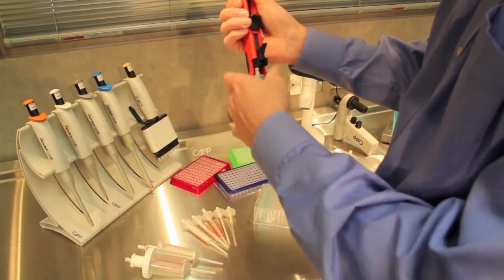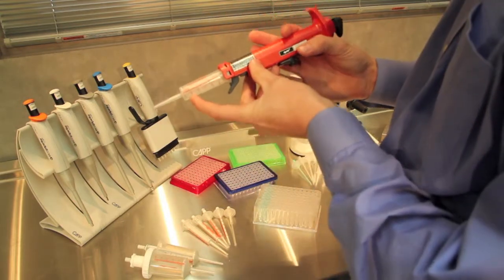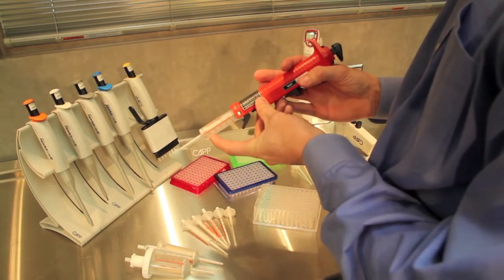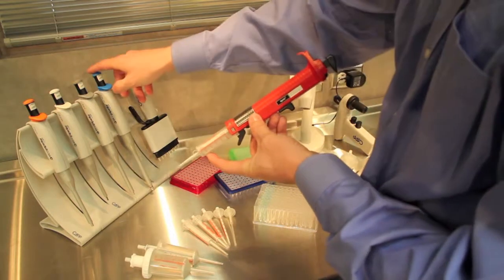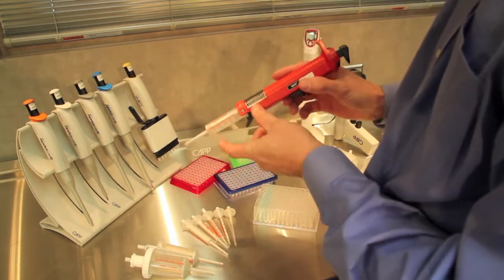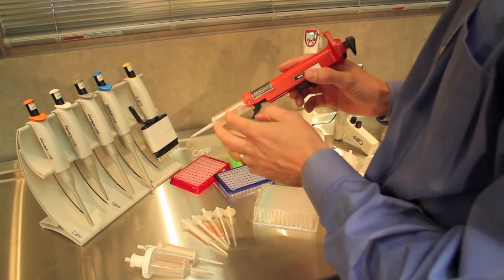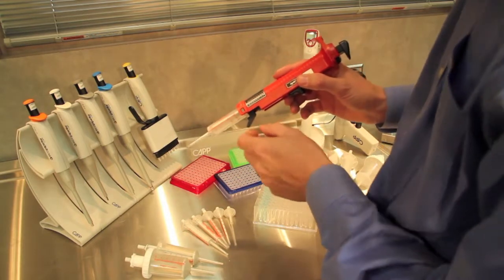Simply load the syringe in. Now this is a positive displacement syringe as opposed to the pipette which is an air displacement syringe. So if you have viscous liquids or difficult liquids, this is also a very good option for those.